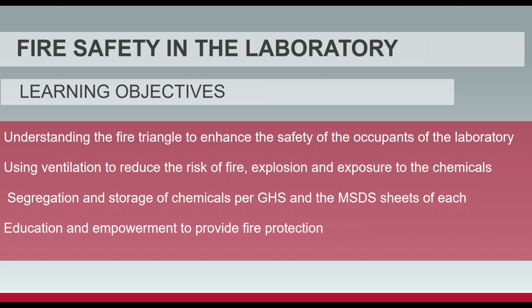Material safety data sheet, MSDS or SDS, depending on how you use that analogy. And then ultimately, and most important, is education empowerment to provide fire protection. What I mean is, in your specifications, right in there, that whoever wins the tender needs to train the people how to use your technology and my technology together to create that safe environment. So let's get into it.